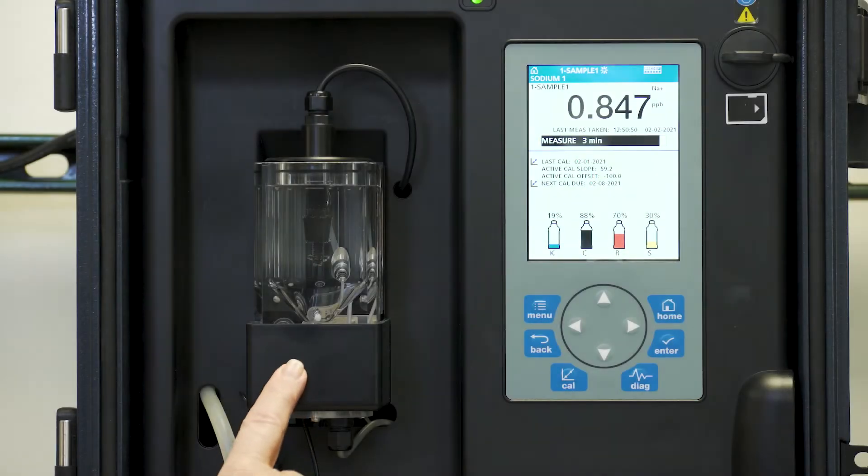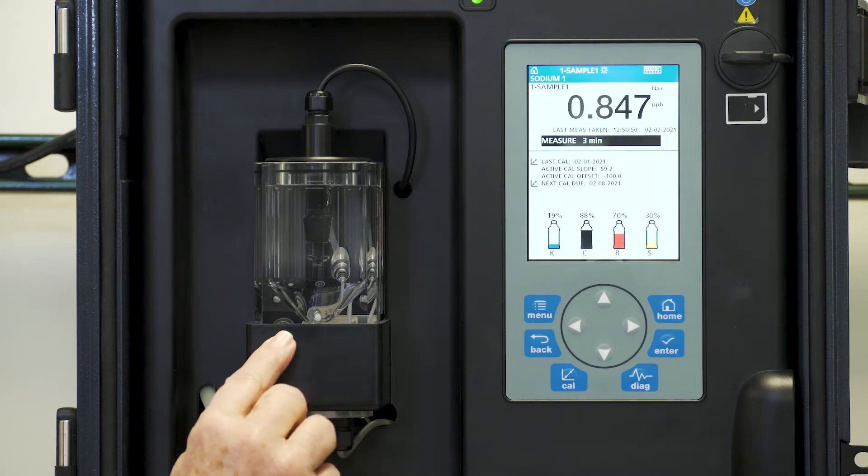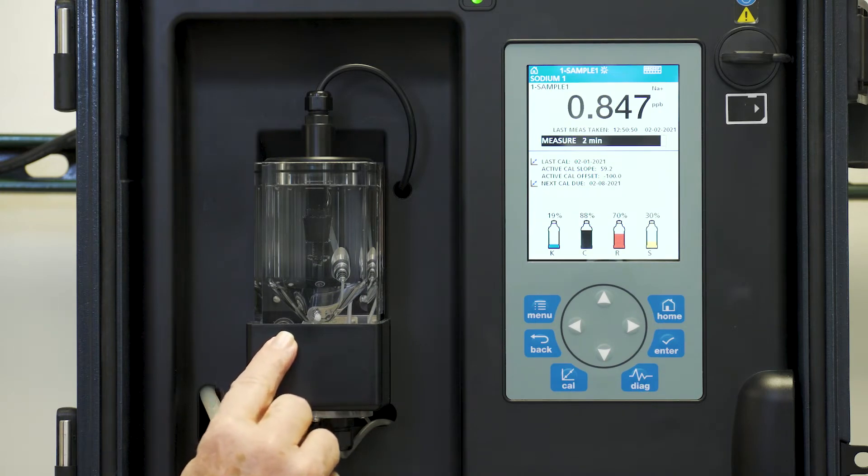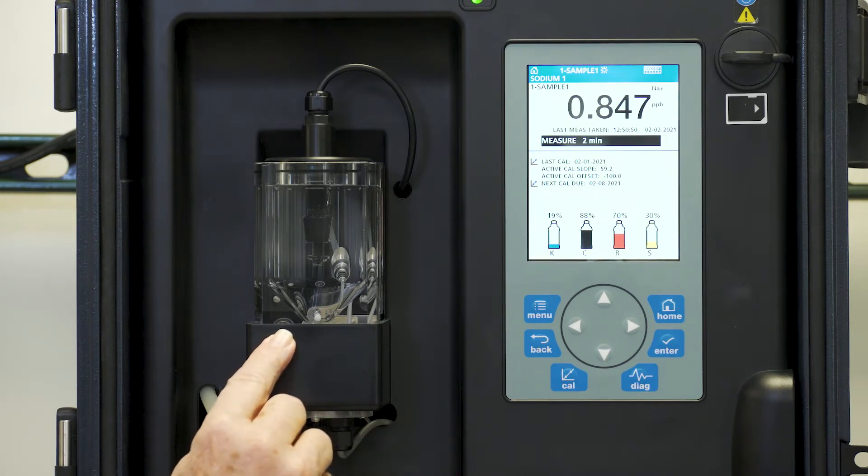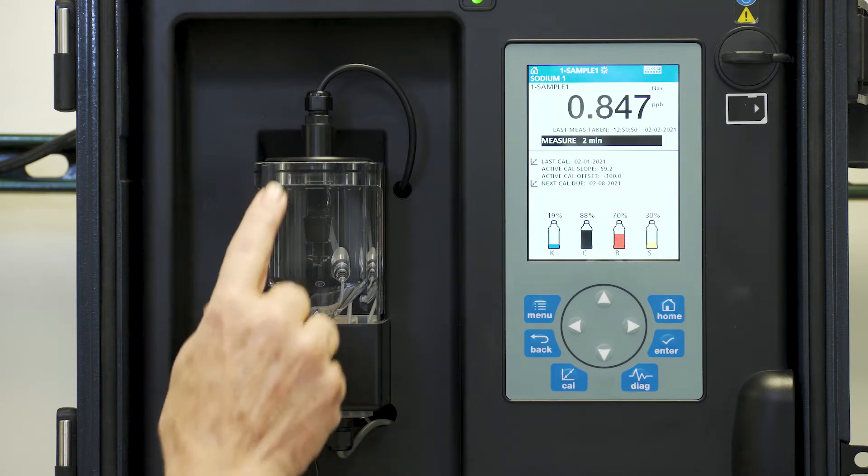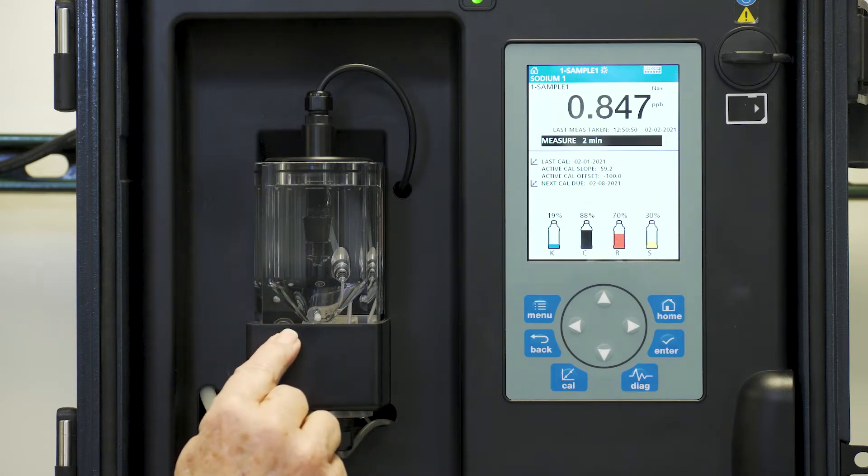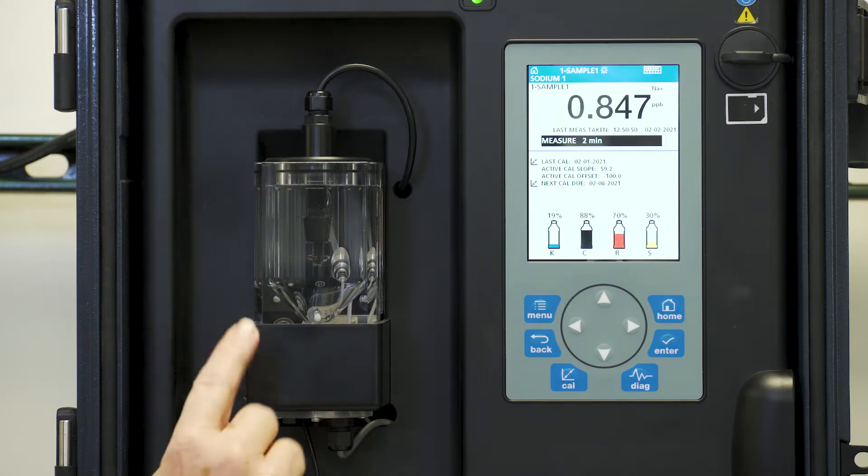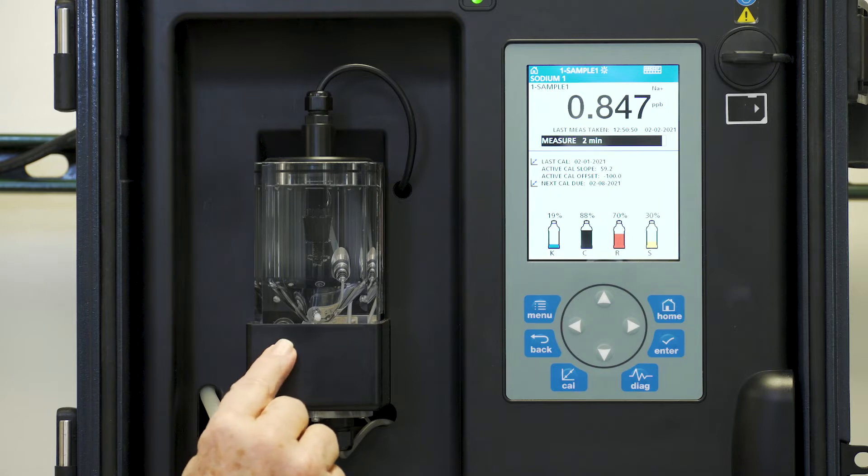Let's move on to the demonstration. The NA5600 allows you to do a grab sample for both an unknown sample or for a standard for verification. The measurement takes place in this overflow cell and then it's measured by the sodium electrode. It's a very simple setup.